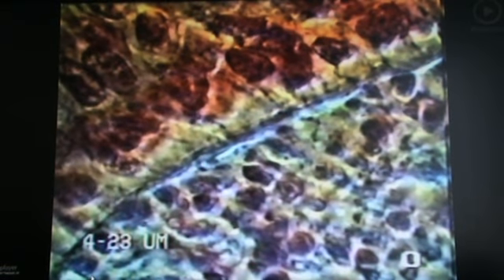With this comparison, you should note that the slide specimen had to be stained in order to be seen under a normal microscope. Using the Ergonome 500, however, such staining is unnecessary and actually disturbs the image. Without staining, you'll be able to see much more.